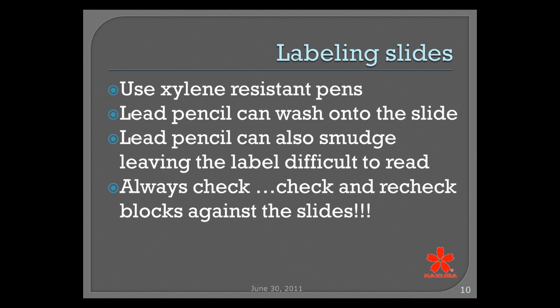If you're using lead pencil, you need to be aware that lead can wash onto your slide. Not to mention that the more you touch the tip of that slide, the lead pencil smudges and you may have a label that's difficult to read. So always check and recheck your blocks against your slides, and be aware that lead pencil can wash onto your slide.